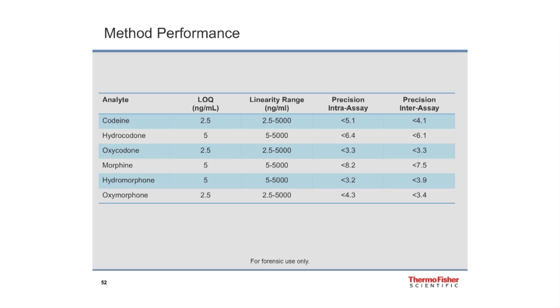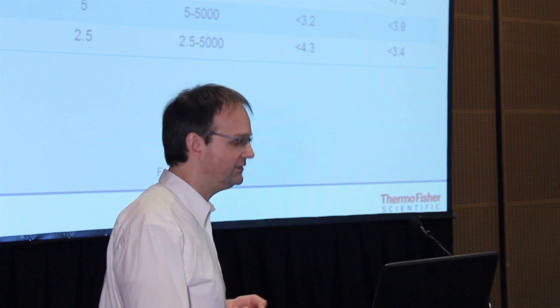So looking into the sensitivity of this approach here, you see LOQ is 2.5 ppb, and knowing, especially in drug analysis, what the active concentrations are that you need to have an effect, we are way below the active concentrations. So no problem to detect everything you need.